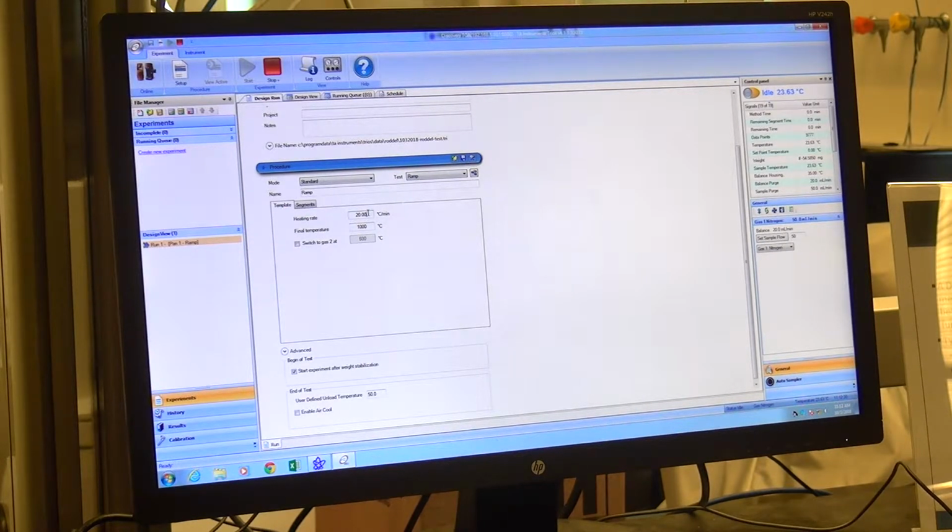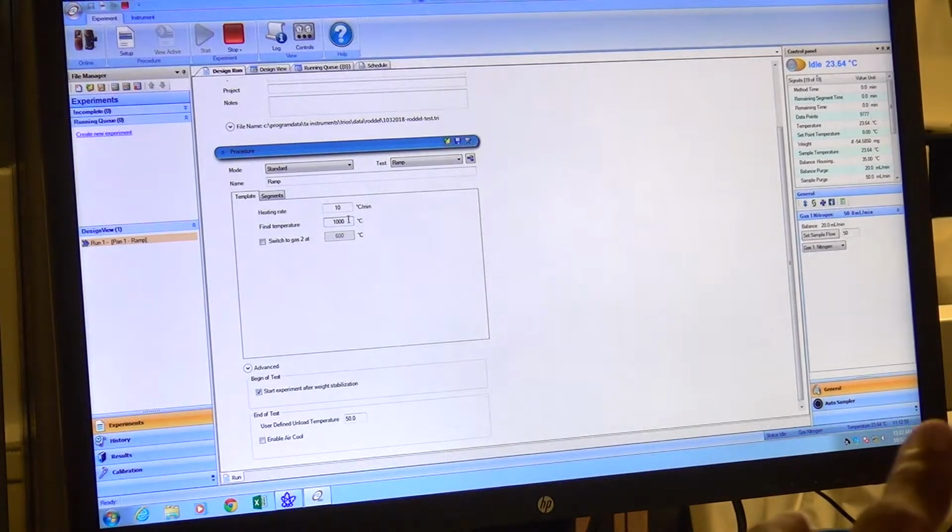So you fill in the heating rate. Standard heating rates, again, are 10, 20 degrees per minute. I've seen 5 degrees per minute as well. These are pretty standard heating rates that you would see in the literature. So I would suggest to start with one of those. I generally like to start at 10 C per minute. And then you would make the decision after you see that first set of data whether you would like to change that, whether speed up or slow down.